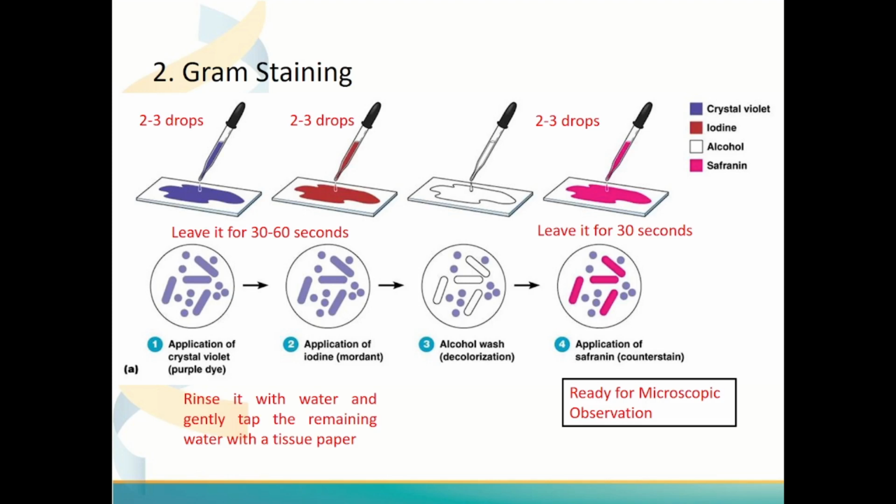And finally, we can add two to three drops of a counterstain, which here we use safranin as a counterstain, and wait for 30 seconds. Tilt and rinse with water, and gently tap the remaining water with a tissue paper. And after that, the samples are ready for microscopic observation.